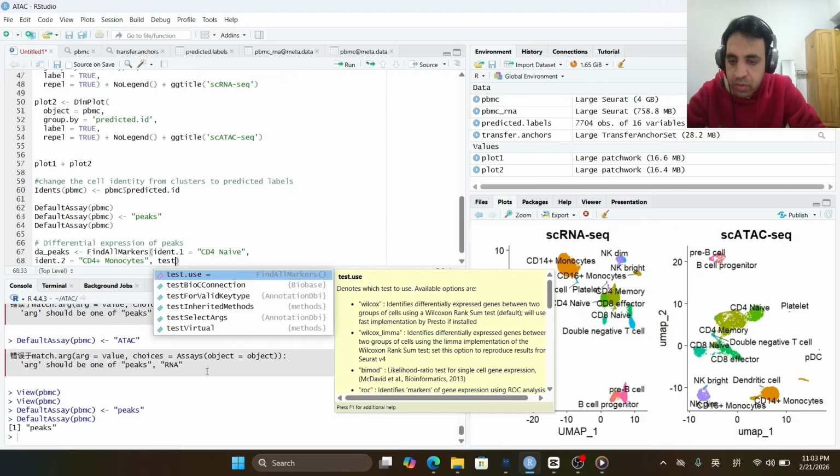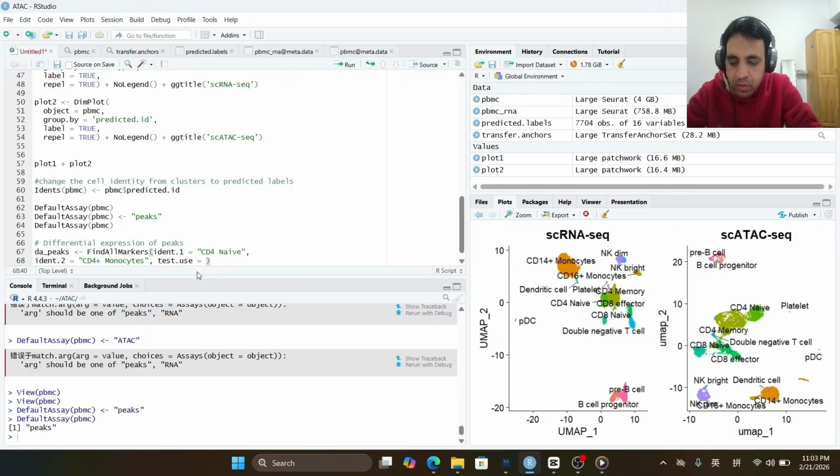We will use the Wilcoxon test by default.